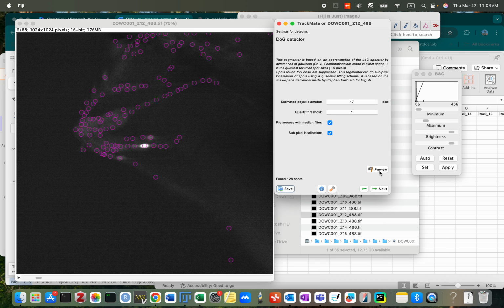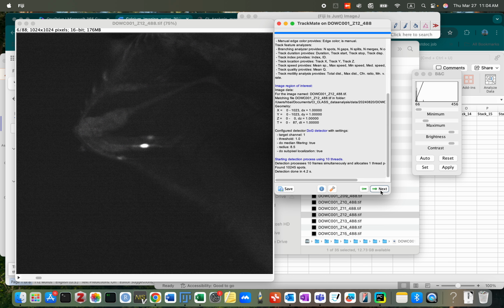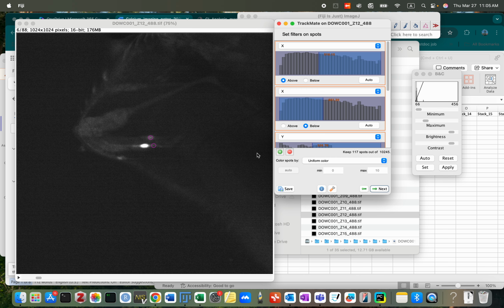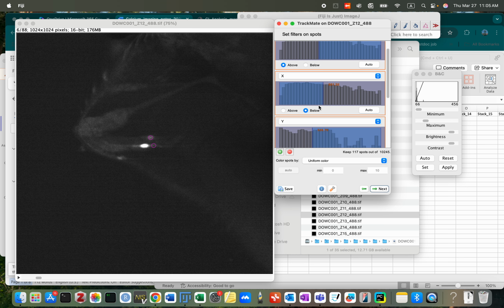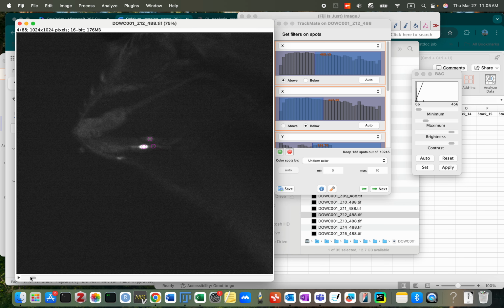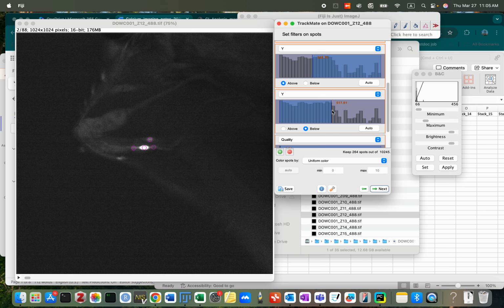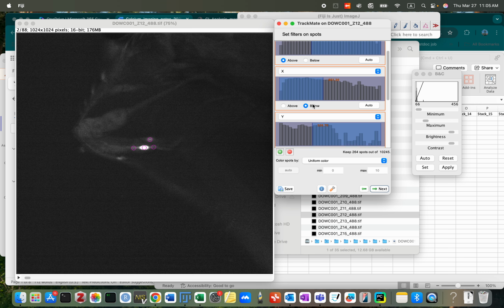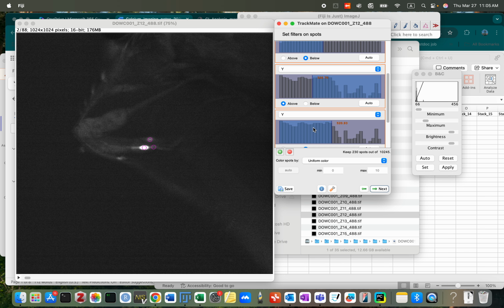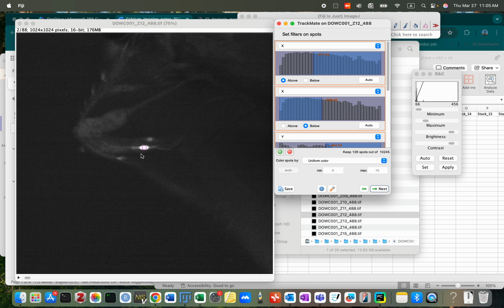Good. Okay. We need to change the filter because we are working on another cell. Okay. So to select neuron 1, play with XY a little. Now we are focusing on neuron 1.